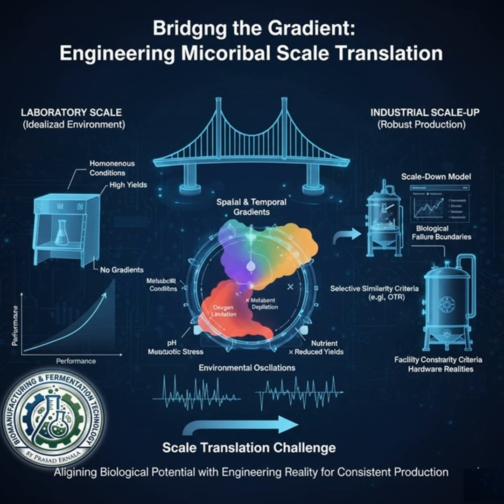So what do they prioritize to solve that? They prioritize maintaining a very high Reynolds number, something over 100,000. This drives the choice of the impeller and the speed, all to ensure really intense circulation. They're focusing on bulk liquid movement to solve the substrate gradient problem, which is the organism's known weak spot. Even if that means maybe compromising a little bit on something else, like the maximum possible kLa. Exactly. You sacrifice a little on one front to solve the problem that will actually kill your process.